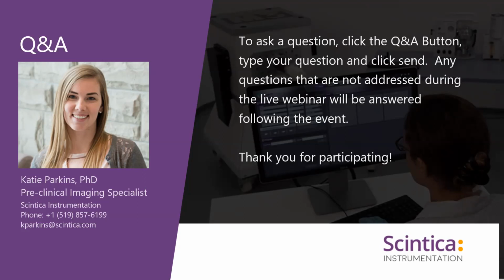That's what we would refer to as multiplex imaging. You can also have multimodal imaging, where you are still tracking two different biological processes within the same animal, but you're using different systems. So maybe you have a bioluminescence reporter, and then you also have a PET reporter to look at something else. That would be considered multimodal.